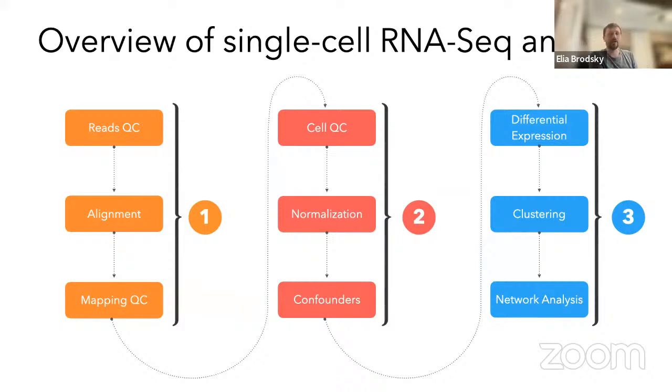Basically, that's the idea. Number two, you then normalize, because you have so many different cells, so you want to normalize the data. And once you normalize the data, you then want to assign them into particular clusters, right? So the idea of clustering, we'll return to that later, how to perform clustering in a meaningful way. That is the overall kind of review.